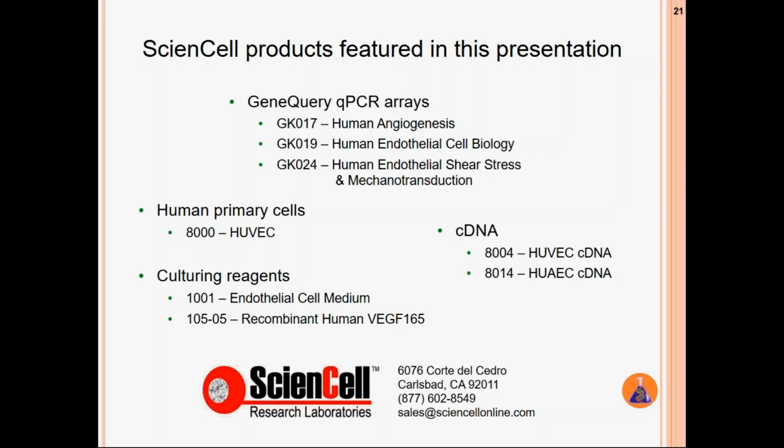One question is asking, do you have kits for mouse samples? Currently we only have human kits, and all animal kits will be custom made at no extra charge, though it is $240 per 96-well plate or $45 for one primer set. The turnaround time will be 2 to 3 weeks for individual primer sets or 3 to 4 weeks for plates.